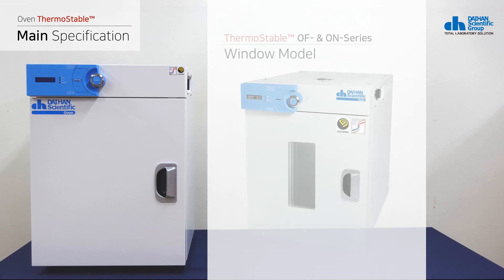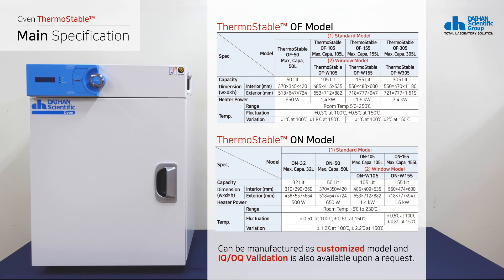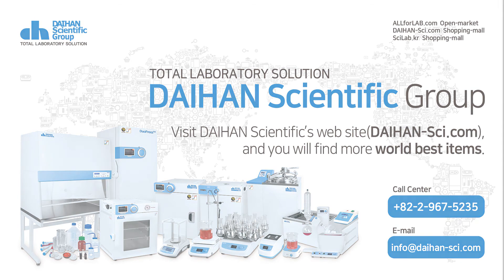Both models also have a window model that allows users to see inside the drying oven. Daehun Scientific's drying oven can be manufactured as a customized model, and IQ/OQ validation is also available upon request. I've briefly introduced the Daehun Scientific drying oven. Visit Daehun Scientific's website and you will find more world-best items. Thank you.